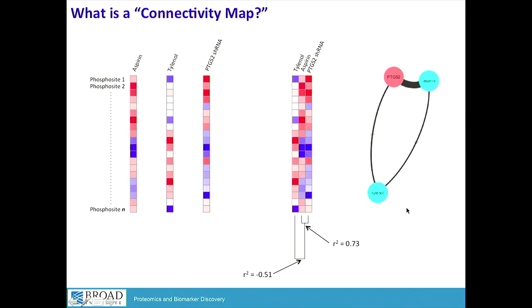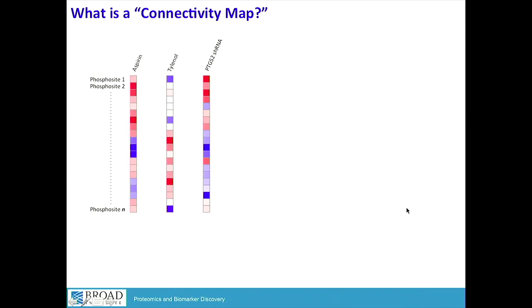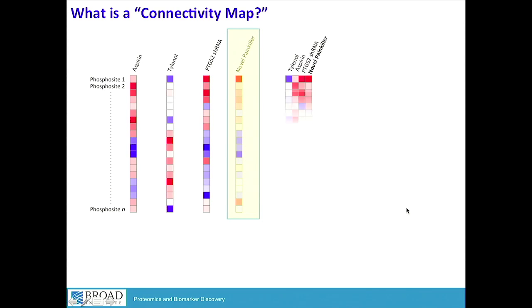And so now let's say we do some new experiment where we take a new drug, a new painkiller candidate. We want to ask the question, how is this thing working now in cells? So we can use our targeted assay panel to generate new data. We simply add it into our heat map and calculate further correlations. And again, it's already apparent that maybe this painkiller has a signature that's more similar to aspirin than Tylenol.